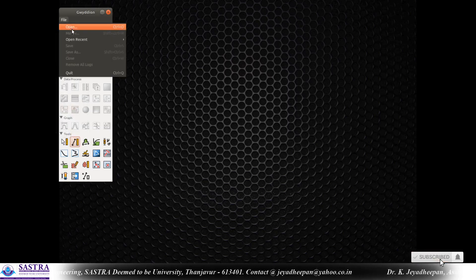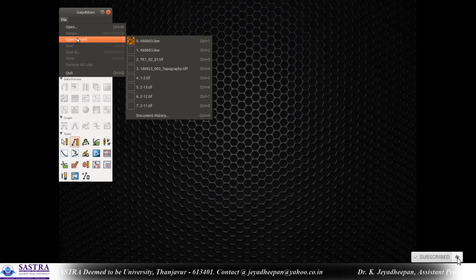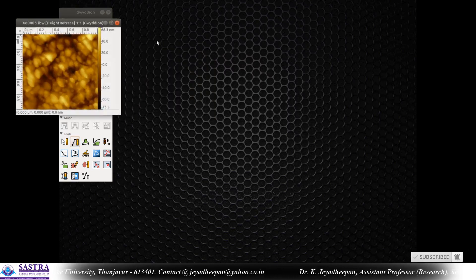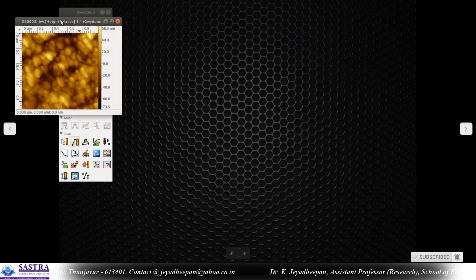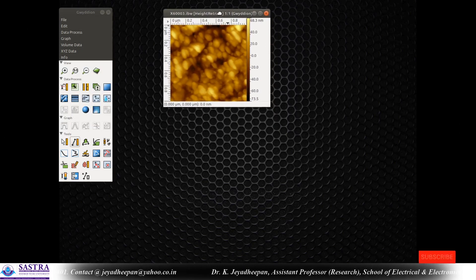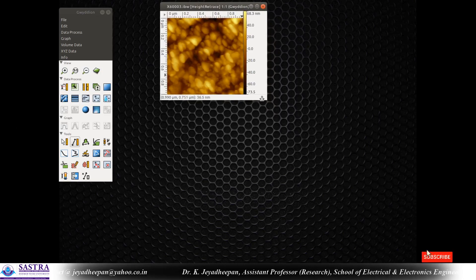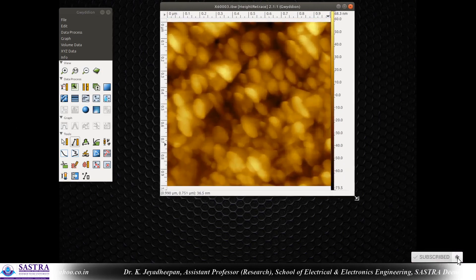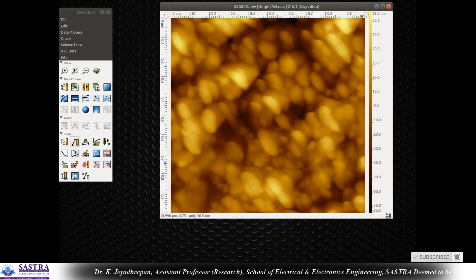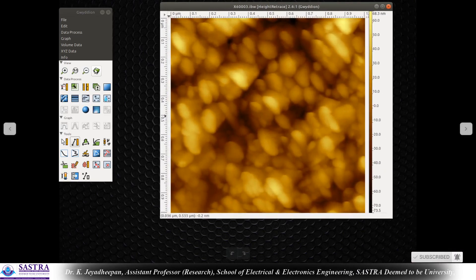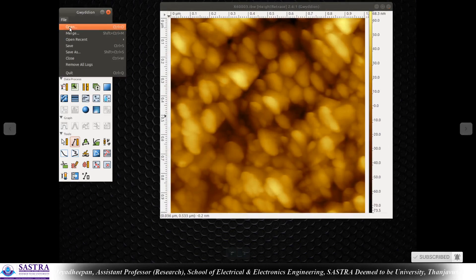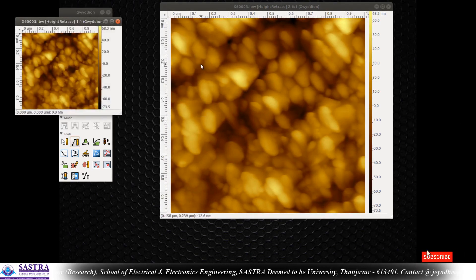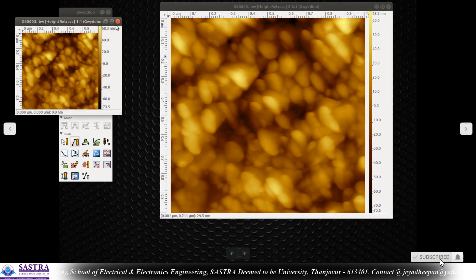Next, go to File and open the AFM image file you want to analyze. I'll take this one as an example for the analysis.